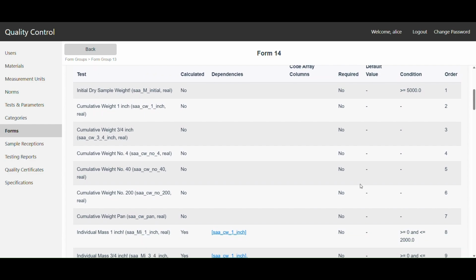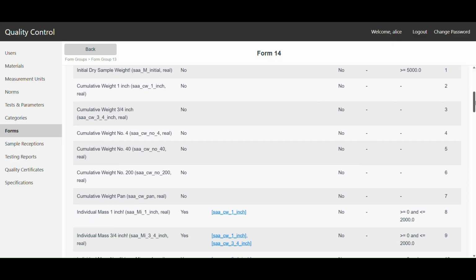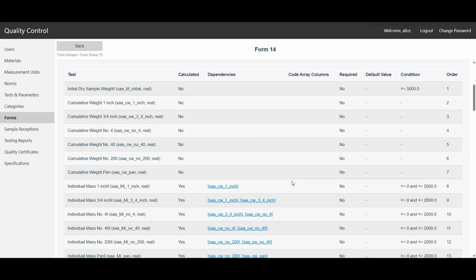I implemented this one up front. So let's see what we have recorded. First, the measurements.